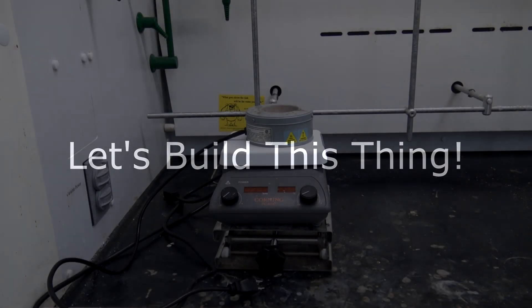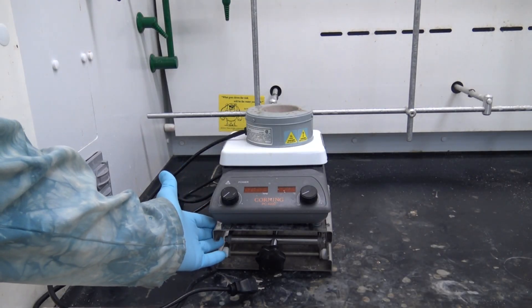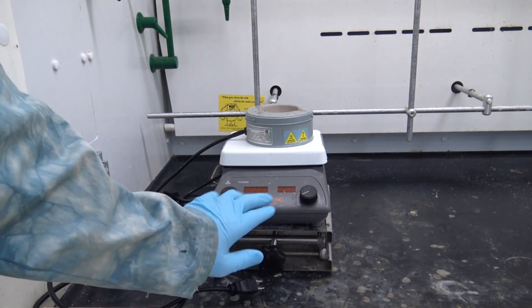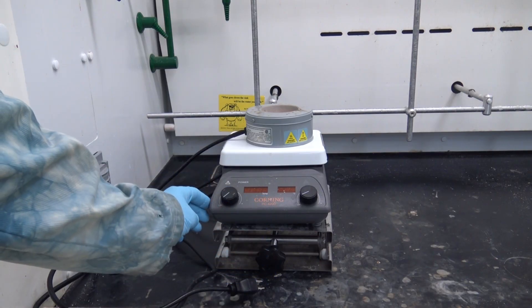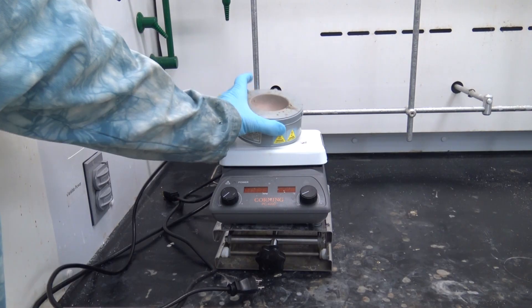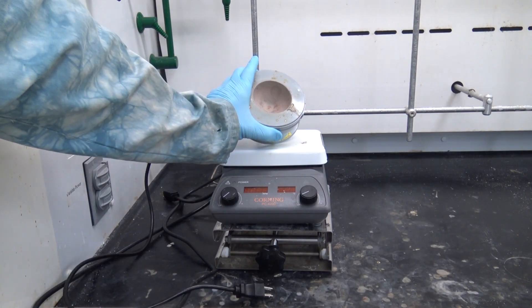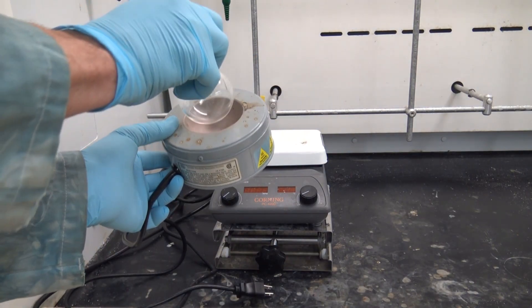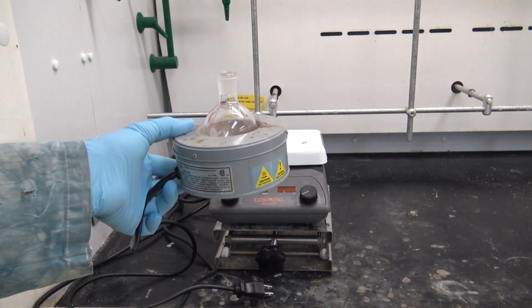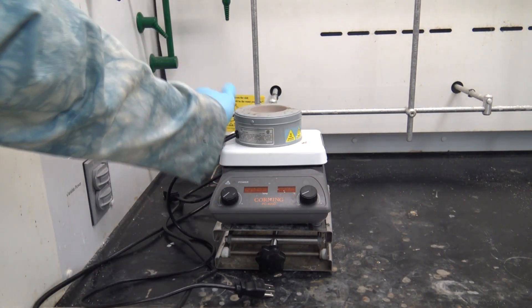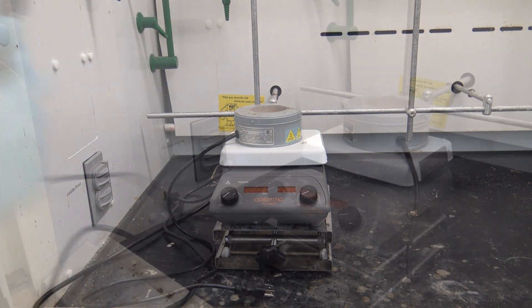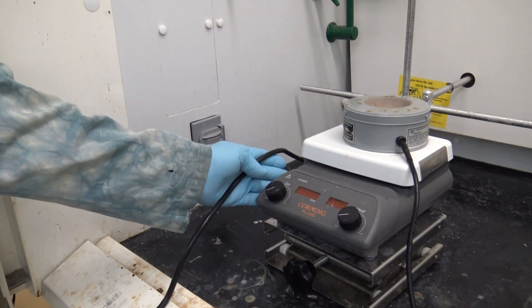So let's get started. In order to build our apparatus we'll need a lab jack and a stir plate. Now that's also a hot plate but we're only going to use it for stirring this time and we're going to use a thermal well as our heat source. We want to be sure that thermal well is the appropriate size for the round bottom flask we intend to use. Be sure it fits snugly. Now we're ready to go. Let's get those electronically connected.